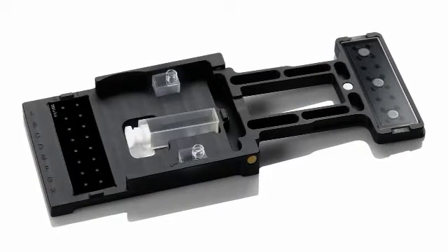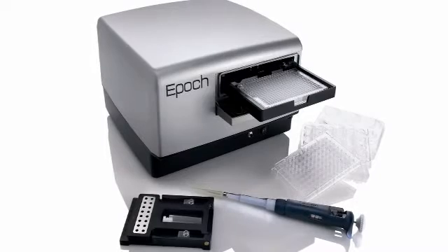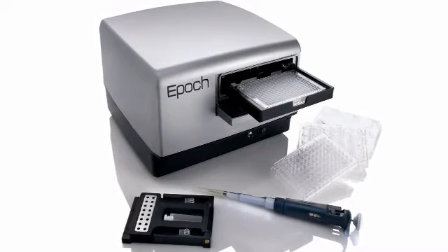Biotech's Take 3 plate has a simple but innovative design for measuring multiple low-volume samples, which is particularly useful for direct nucleic acid and protein quantification.